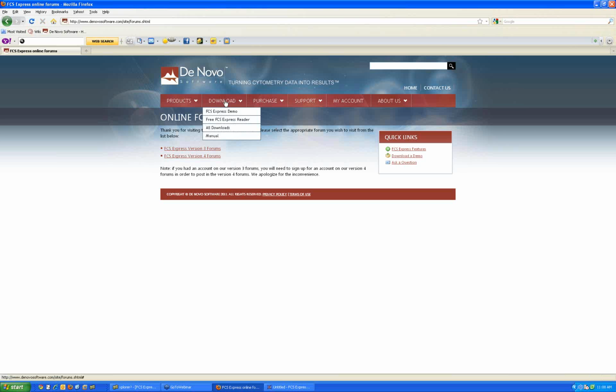Speaking of giving it a try, you can download the version 4 demo from Download FCS Express Demo. There's a 30-day trial just like before. You should be able to load up all of your old layouts and try out the new features.